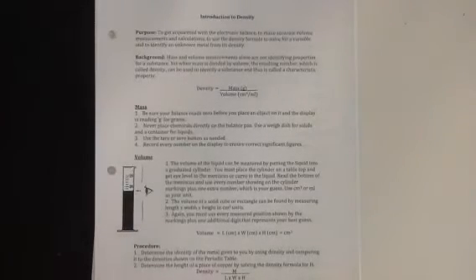The density lab. So the purpose of our lab is to use your measuring skills, manipulate equations, and solve for unknowns using significant figures. So flip it back over to the procedure side. There are 3 parts to our lab today.